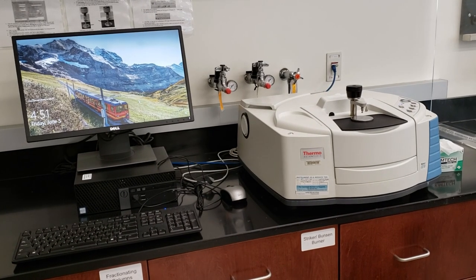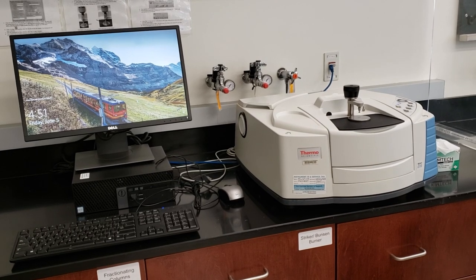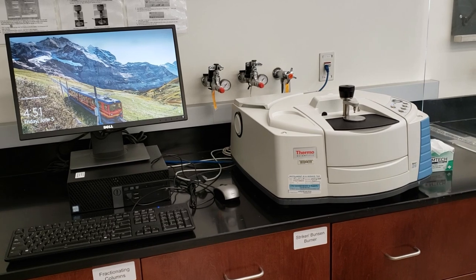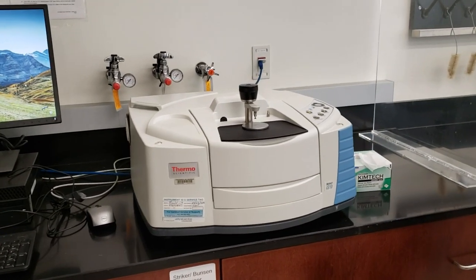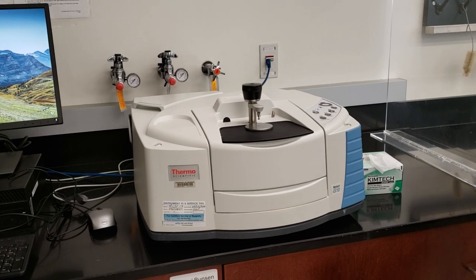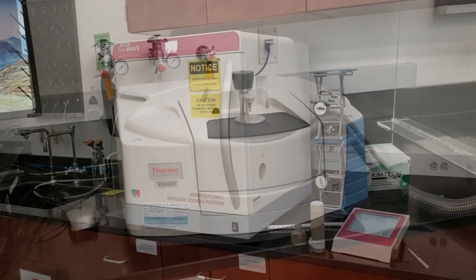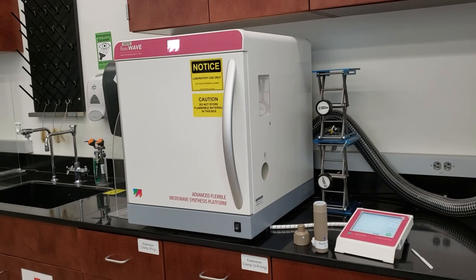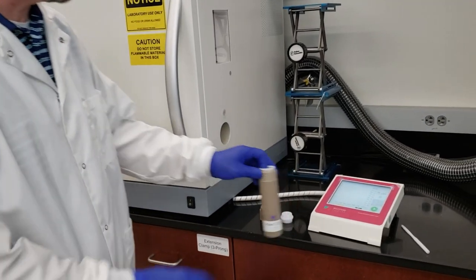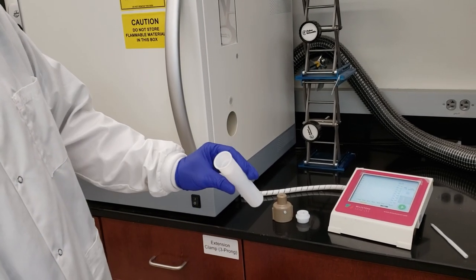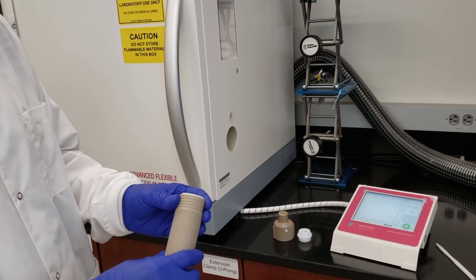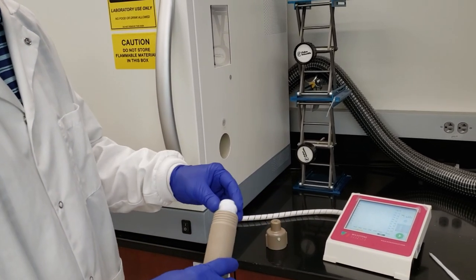Let's look at instrumentation available in each organic undergraduate laboratory. Here we have our IR spectrometer, a Thermo Fisher Nicolette IS-10, used for various experiments in first and second semester organic. Next is our Milestone FlexiWave microwave unit using simple Teflon reaction vessels. We place reaction components inside and instead of taking an hour to reflux, we can finish in five to ten minutes.